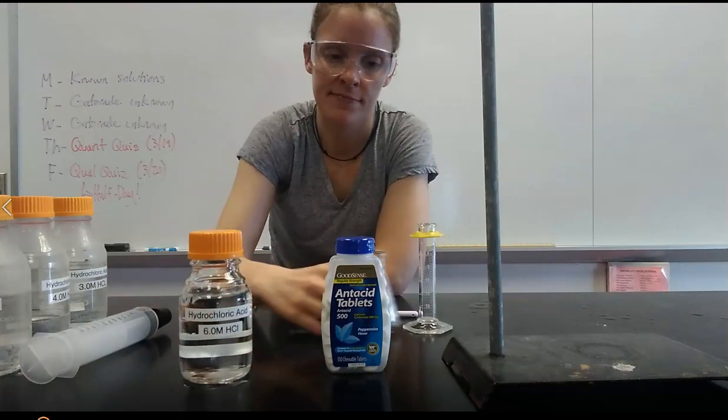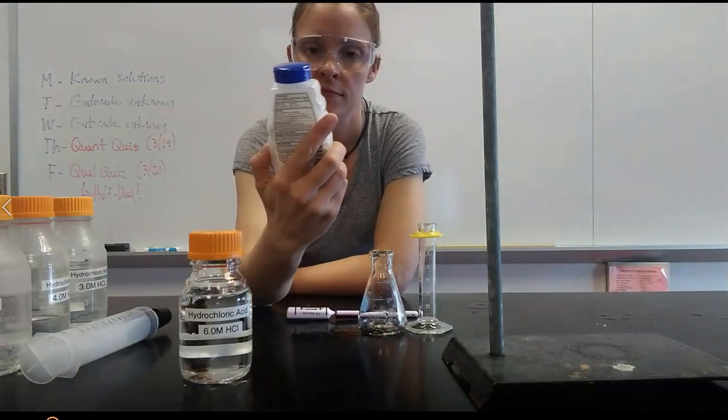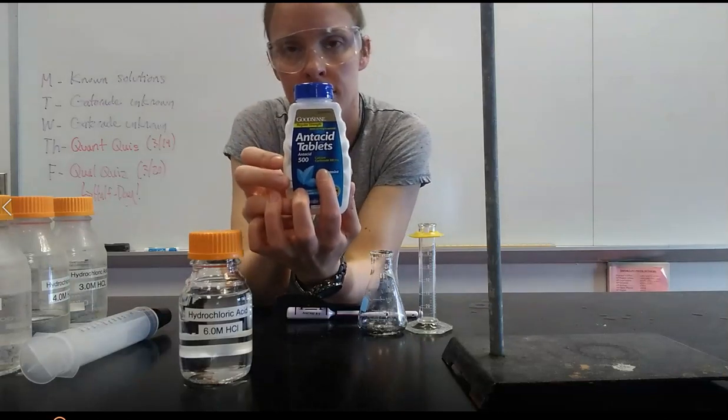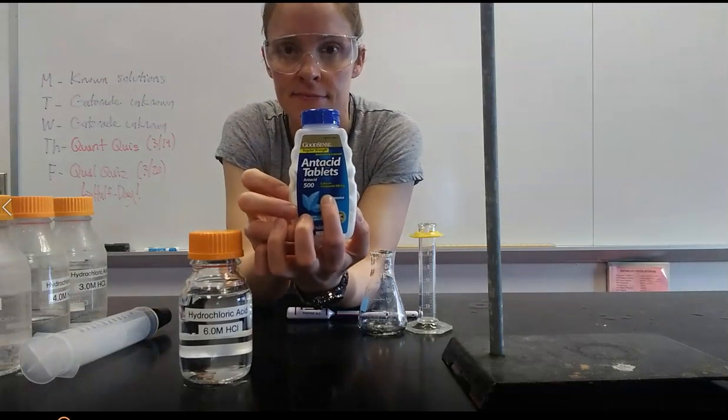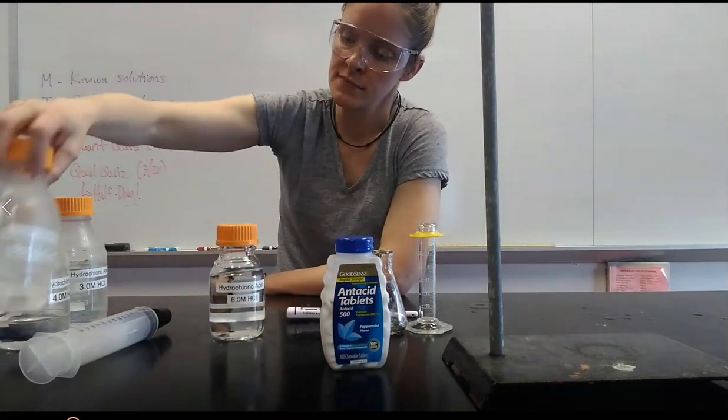In this lab we're going to use 6 molar hydrochloric acid and antacid tablets to study the rate of the reaction. In the antacid tablet, there is 500 milligrams or 0.500 grams of active ingredient.